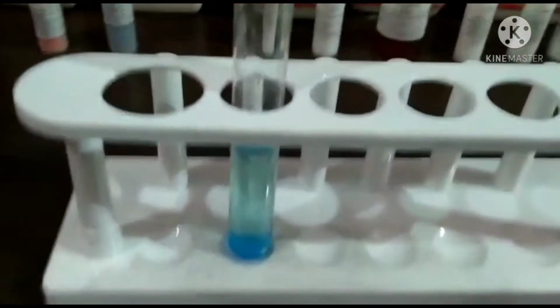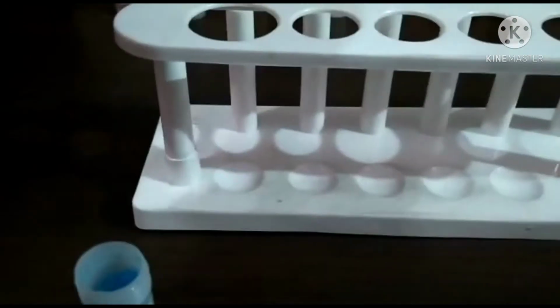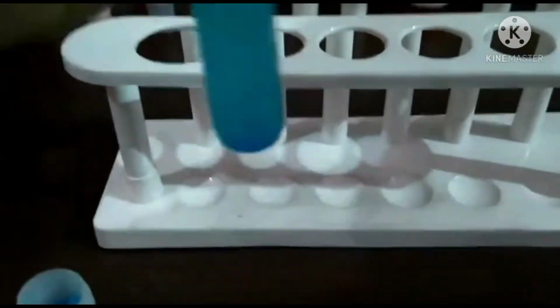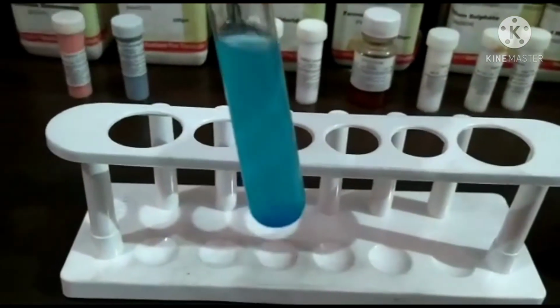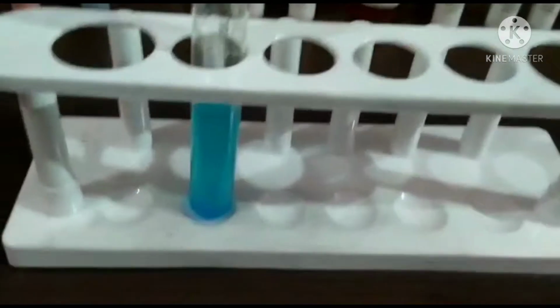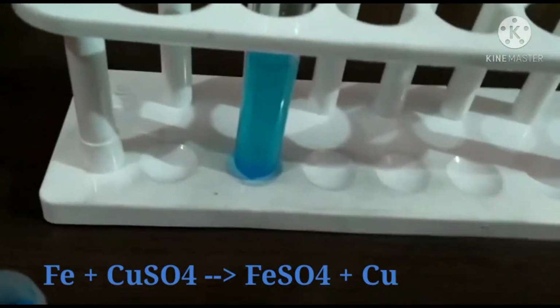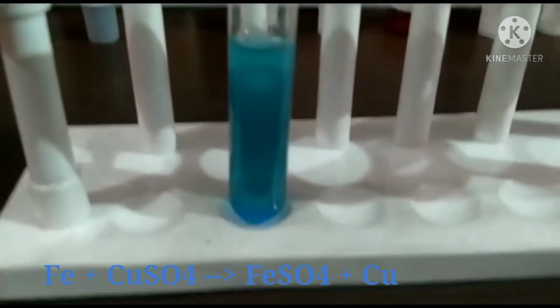First we need to make this solution homogeneous. By vigorous shaking we can make this a homogeneous solution. Now this is looking like a homogeneous solution. Now we will add this iron to the blue color copper sulfate.